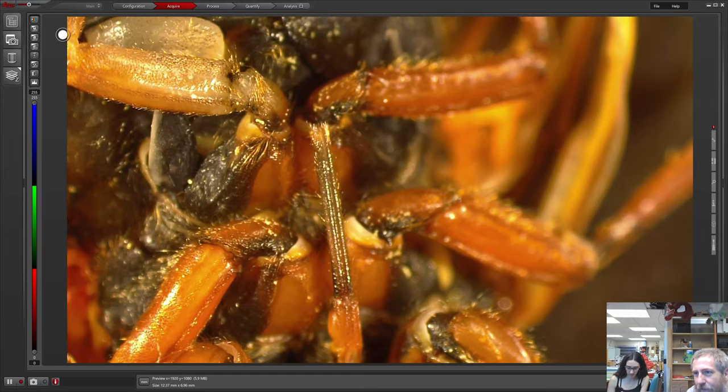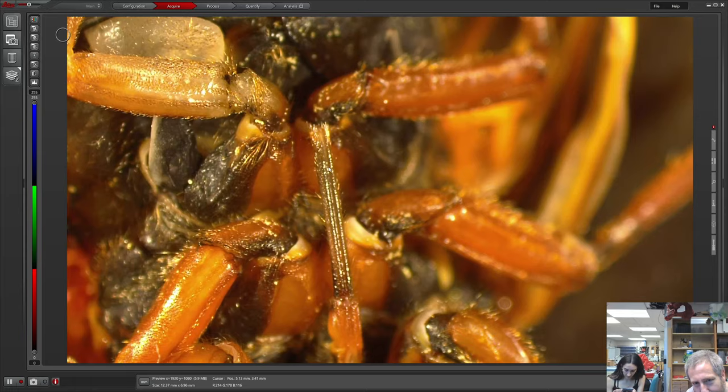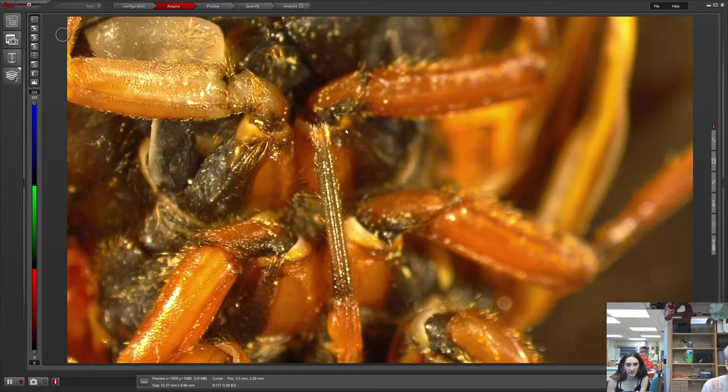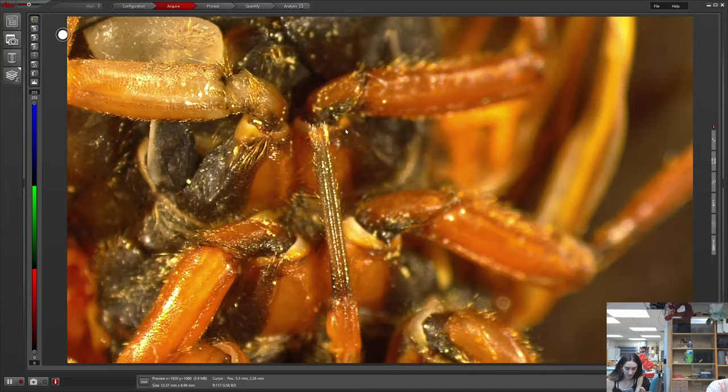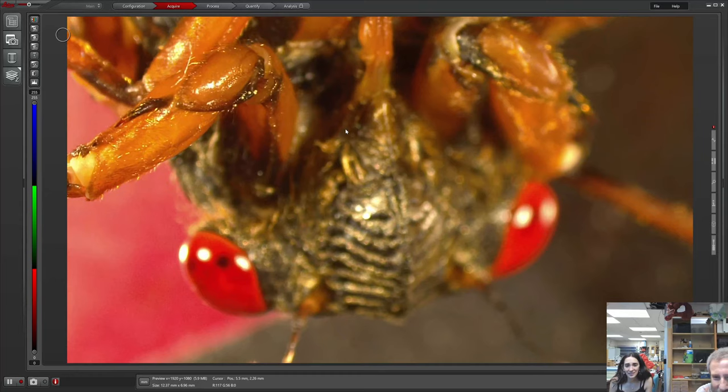I think I had to set it to track my cursor — and yes, it is tracking my mouse. So the mouth is right here, the little end of the mouth — it's wiggling its mouth around. It's on the end of a really long tube, right here, with little hairs around it. That's its cute little face.